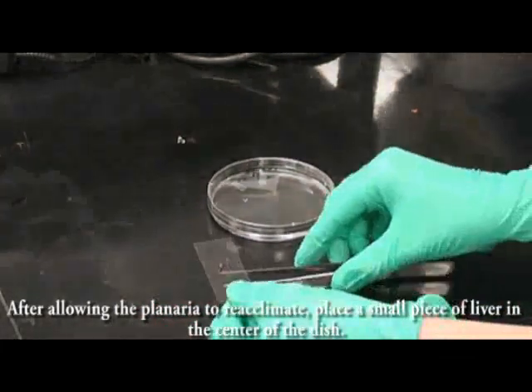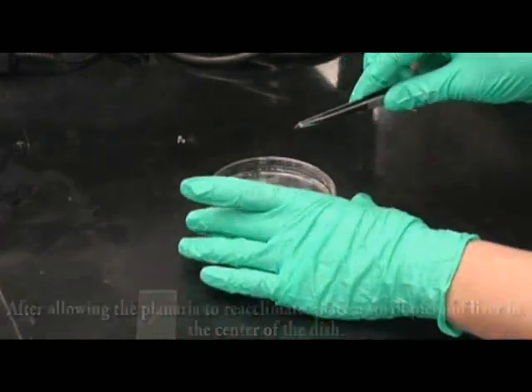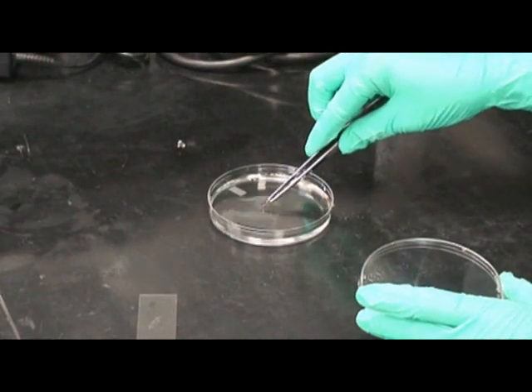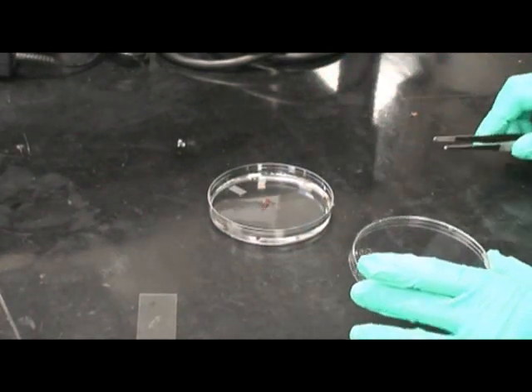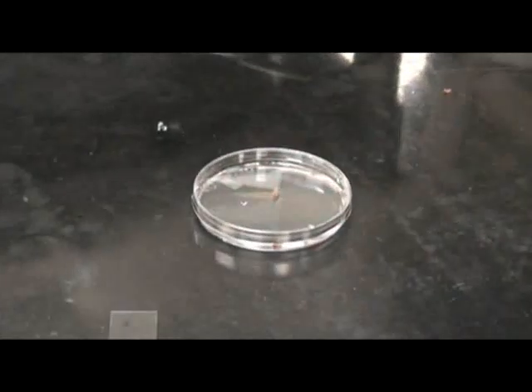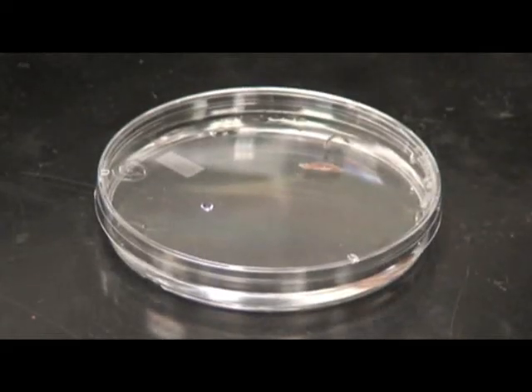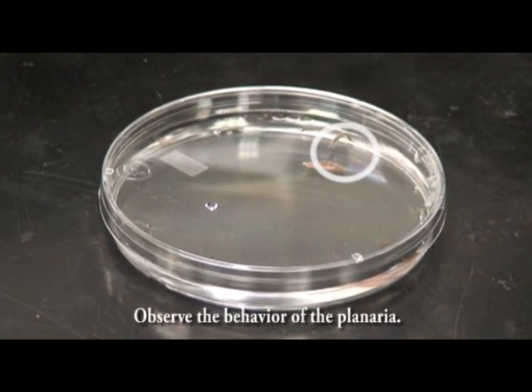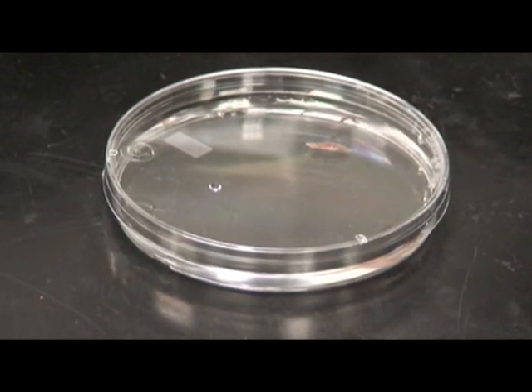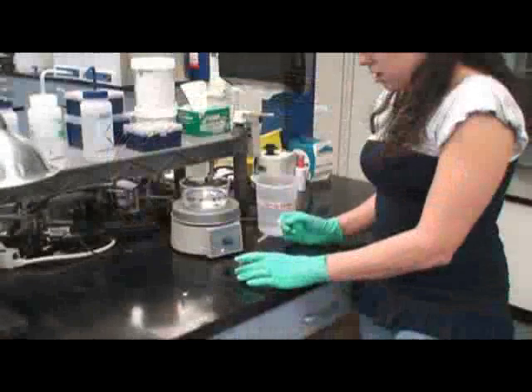After allowing the planaria to re-acclimate, place a small piece of liver in the center of the petri dish. Observe the behavior of the planaria.